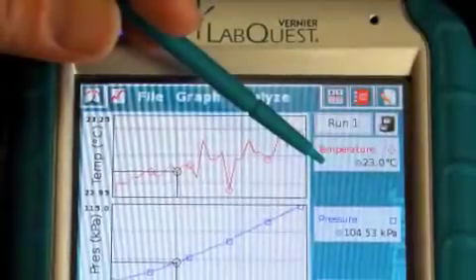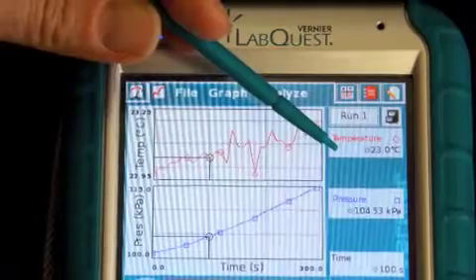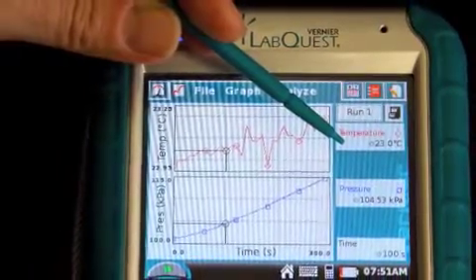When the graph pops back up, you'll notice that in the temperature setting it says 23.0 degrees Celsius, and that's our average temperature over the run of the trial.